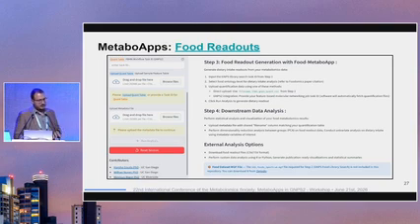But you need to upload that, and to upload the metadata for those samples, as we are doing a more detailed correlation on that type of information and not looking just at annotation. So that's one of the things that is really different from the drug readouts. For the food readouts, to do that estimation, you need more information on the types of samples. One, of course, as I'm going to show in the example, is to look at the difference in diet, if you're doing a diet study.